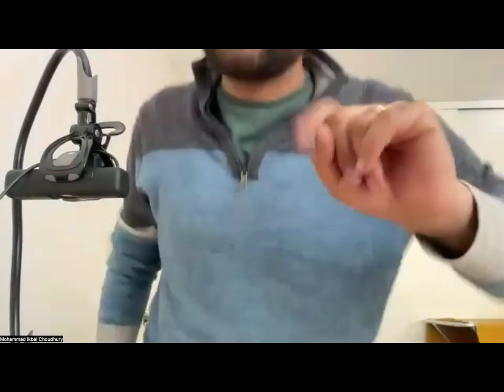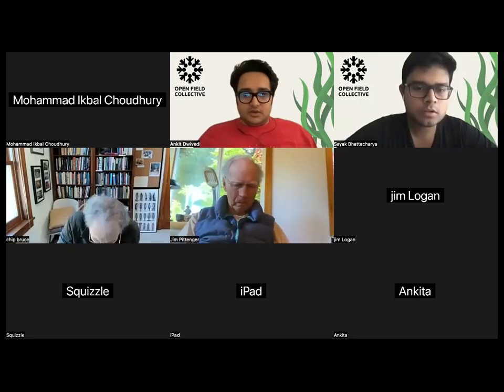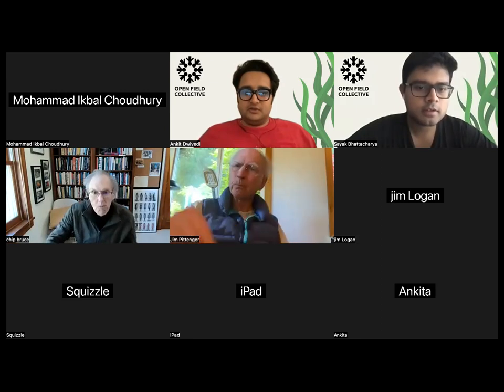So let me just bring it. Meanwhile, try to explore what you see with your foldscope, and you can ask any questions. Ankita will be here, so I'll be back in a second. And we are here. So I can see. Jim, are you able to see anything?